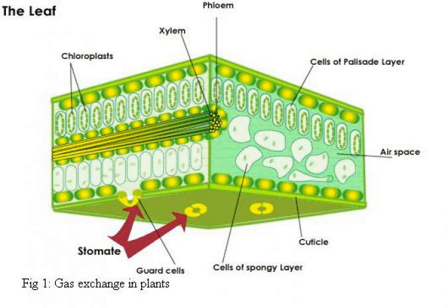Lab 12. Gas exchange in plants. Introduction. Leaves are the primary photosynthetic organs of most plants. Leaf surfaces are equipped with small openings or pores called stomata. Leaf stomata are principal means of gas exchange in plants.